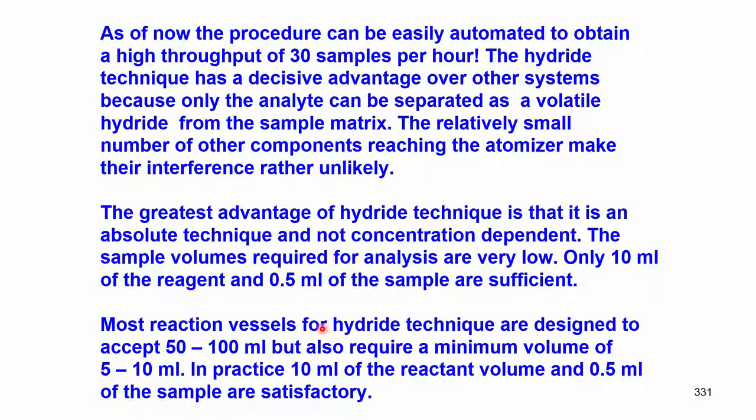The hydride technique has a decisive advantage over other systems, because only the analyte can be separated. This point I have already told you, but I am repeating it once again, because only the analyte elements which form hydride will be taken over into the flame.